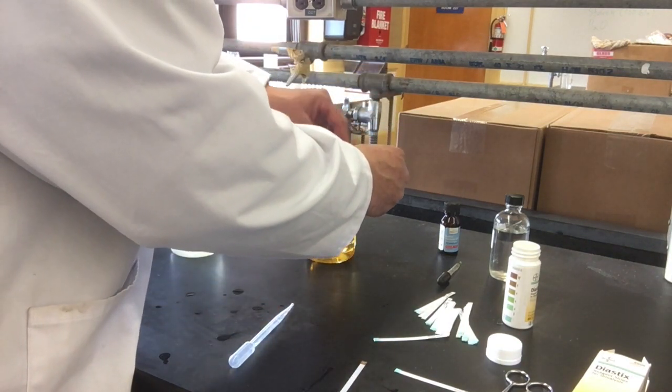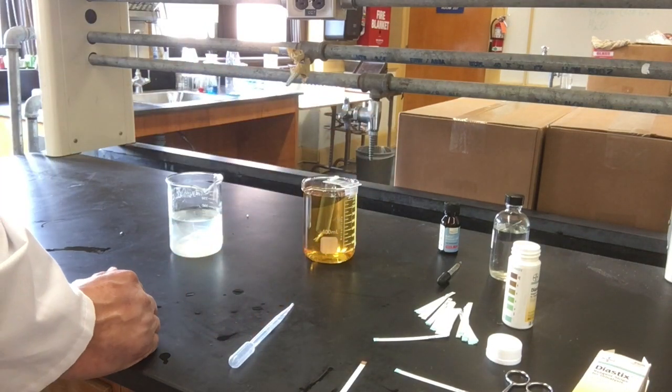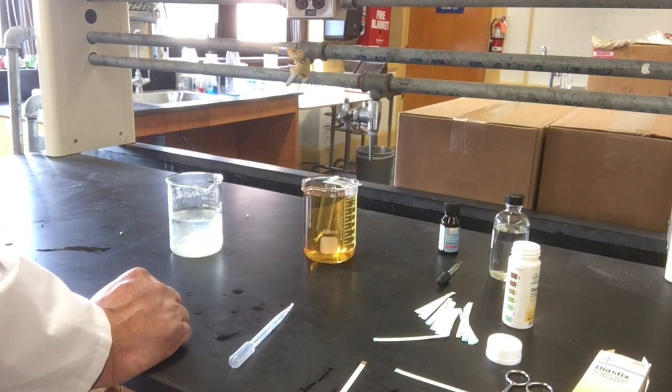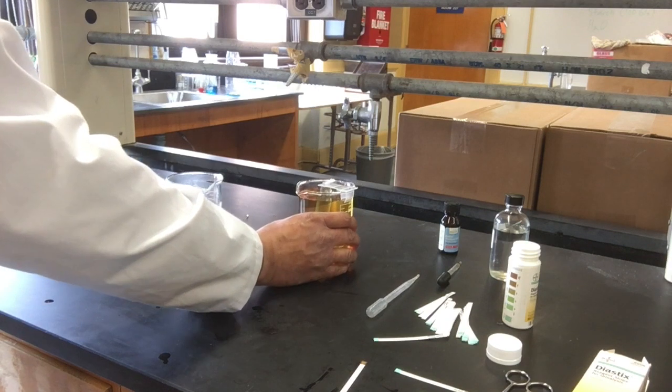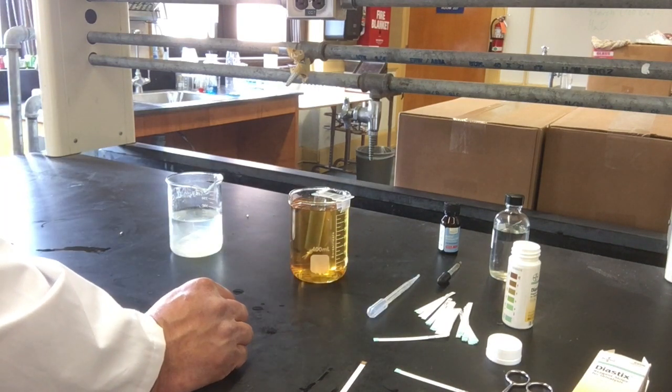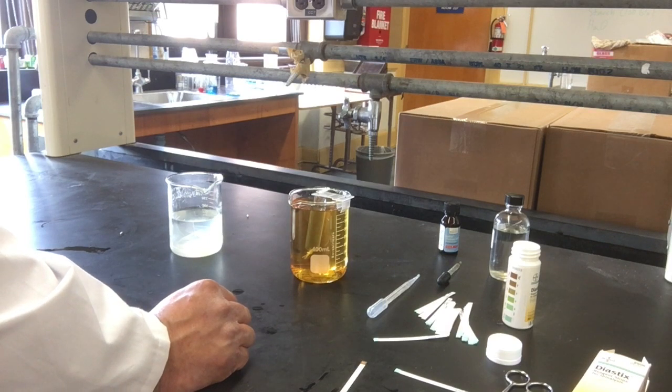Now I'll place the bag in the beaker and let it sit for about half an hour. Inside the bag is glucose and starch. Outside, in the beaker, is water and iodine solution—potassium iodine.